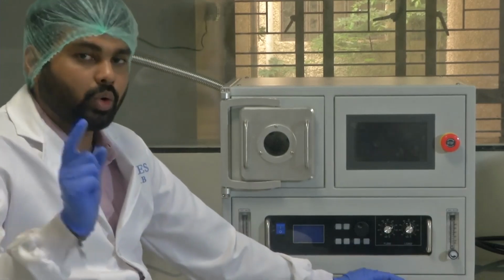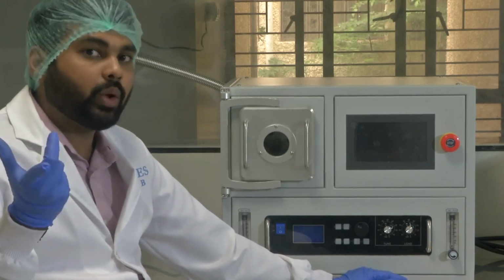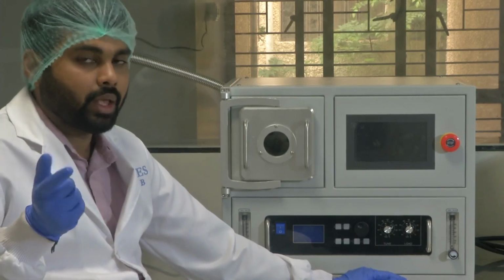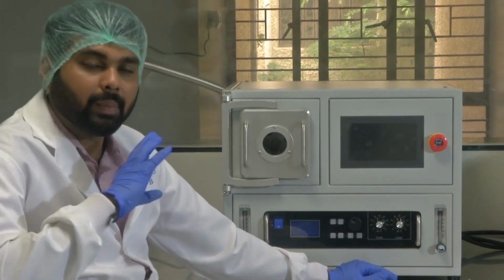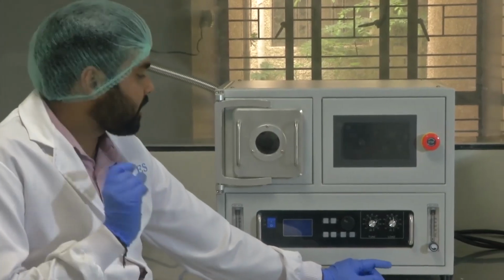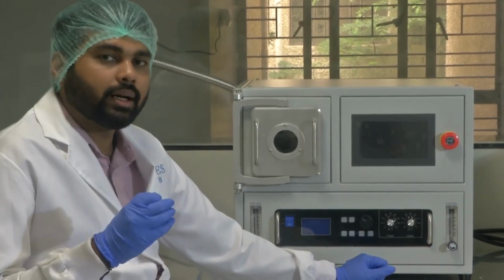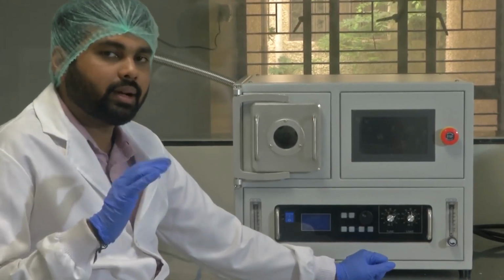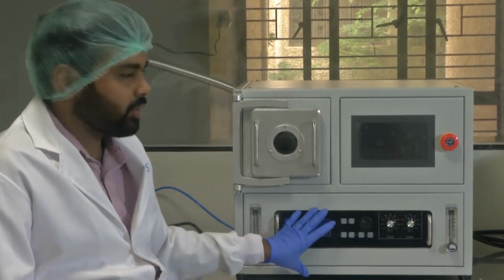I told you also that reflection is dependent on the load. Depending on the load value, the reflection parameter changes. So your load has to be adjusted so that it is equivalent to whatever typical load you will place inside your chamber. And by adjusting the load and tune values, you can minimize the reflected power and maximize your delivered, or forward, power. Okay, this is the RF power.